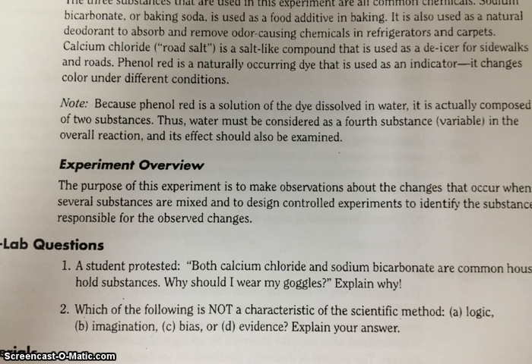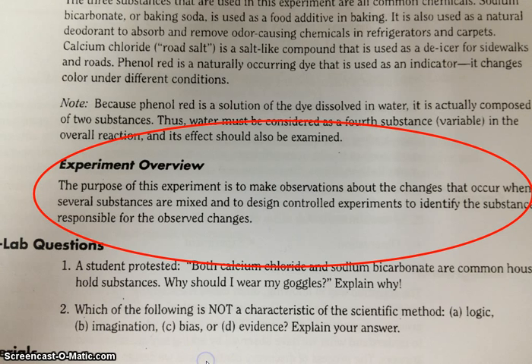You'll find the purpose statement in the experiment overview section. The purpose of this experiment is to make observations about the changes that occur when several substances are mixed, and to design controlled experiments to identify the substances responsible for the observed changes.